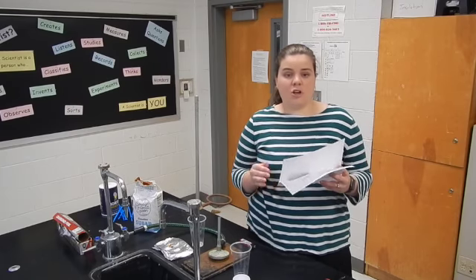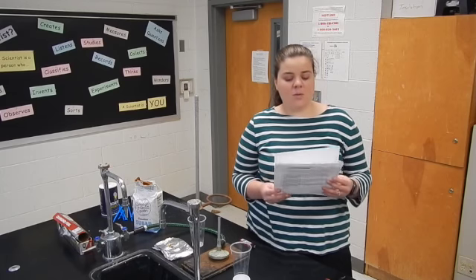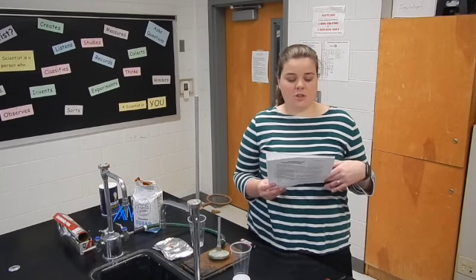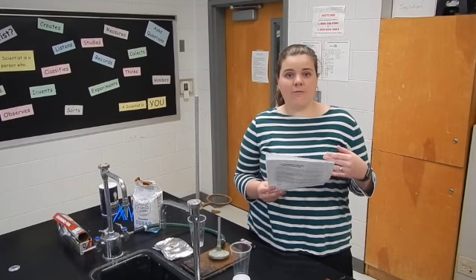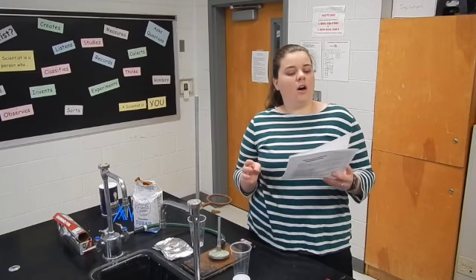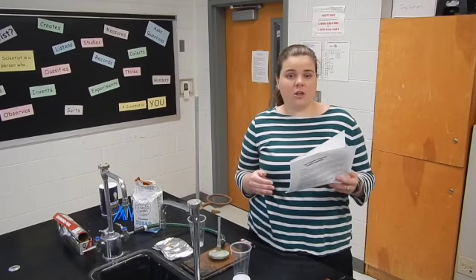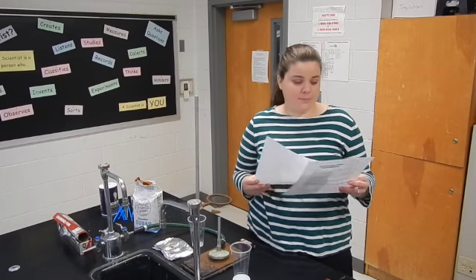There are also charts below that you'll need to fill out throughout this lab. The first one is when we are talking about the salt versus sugar, and then the second one is the 4 unknowns that we'll talk about. So based off of this, you will be able to answer the conclusion questions and fill out the chart for this lab.